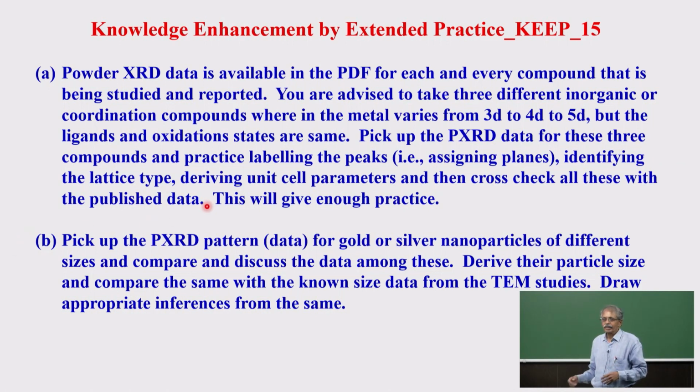What are you going to practice? Labeling, indexing, assigning the planes, identifying the lattice type, deriving the unit cell parameter, and then cross-checking all these with the published data. Preferably you take the cubic type, because that becomes easier. So this will give enough practice. There is no need to give questions like this. There are millions of data available. Another one, this is for the coordination compound.